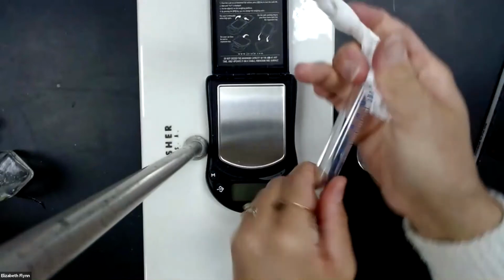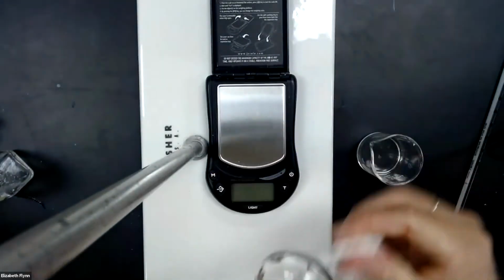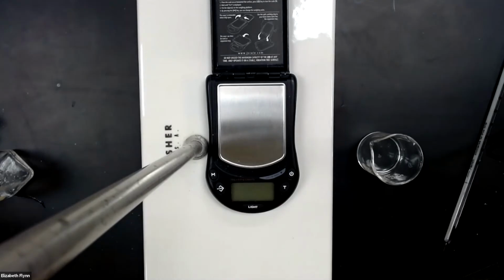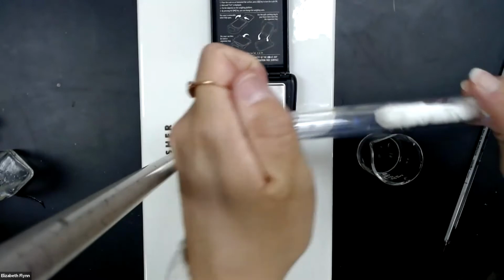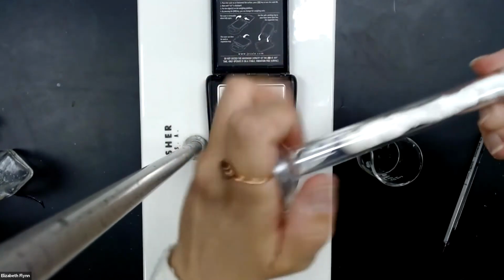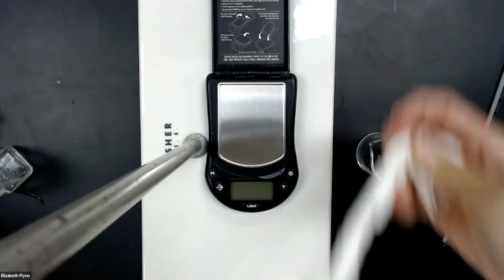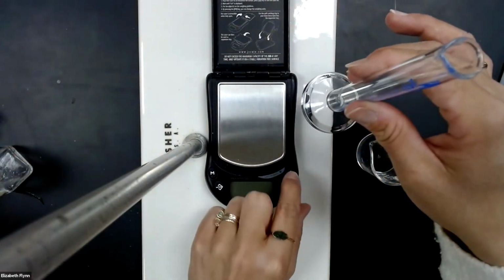Dry them outside too. All right. You see some water, I see some in there. I want to kind of get that out. Because we want to make sure that we account for all the volume that's in the cylinder, we want it to be accounted for in the mass. So we need to make sure that we get an empty mass to do that.